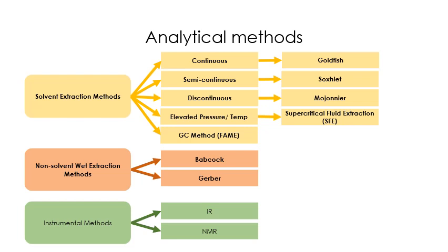We also have the supercritical fluid extraction, but this process is more of a green technology because we don't use most of these toxic solvents. But the extraction method will be more expensive compared to the other methods here. The solvent extraction methods are suitable for semi-solid or solid food products.